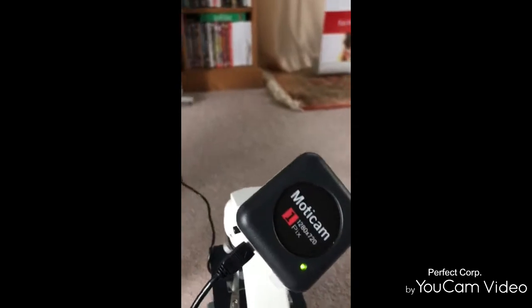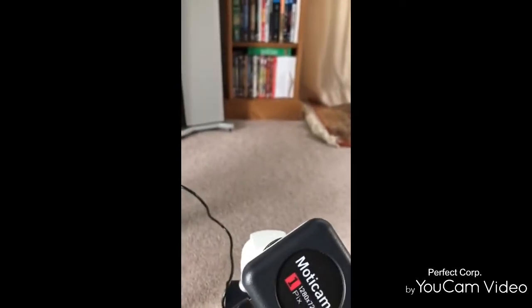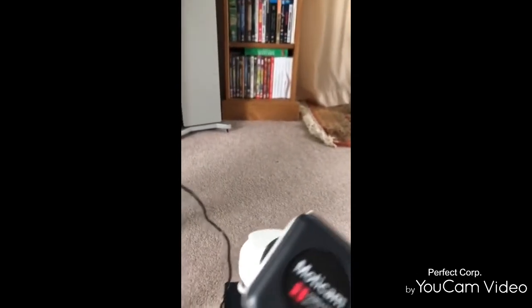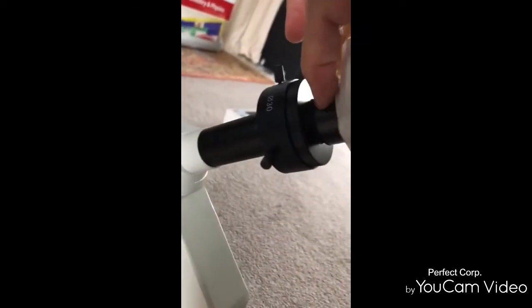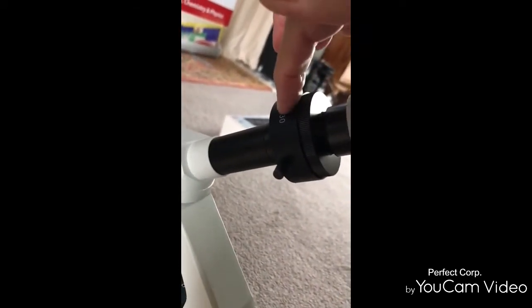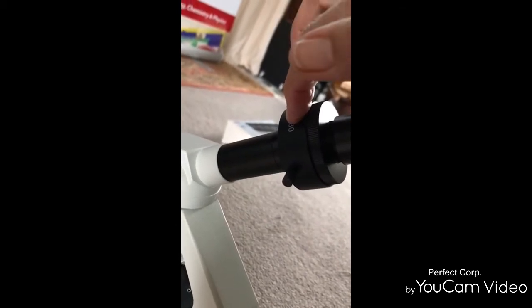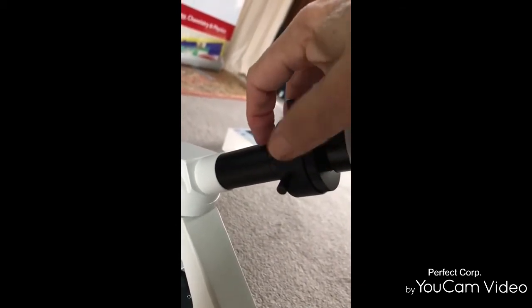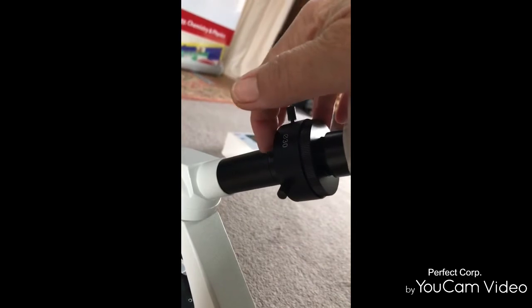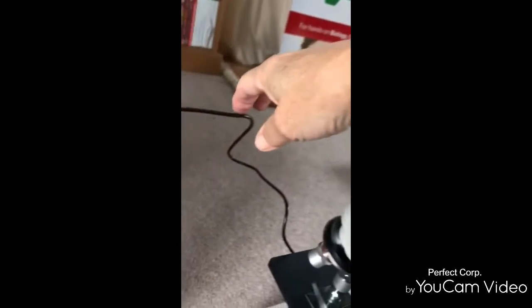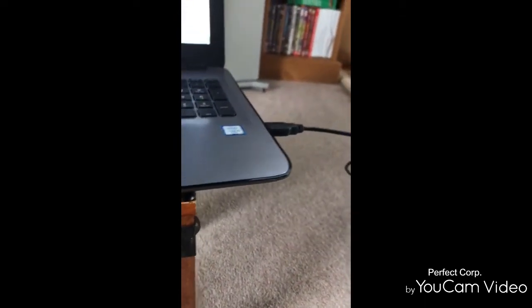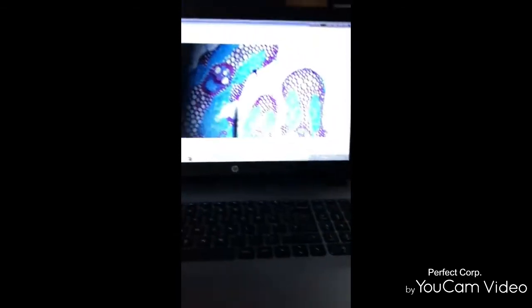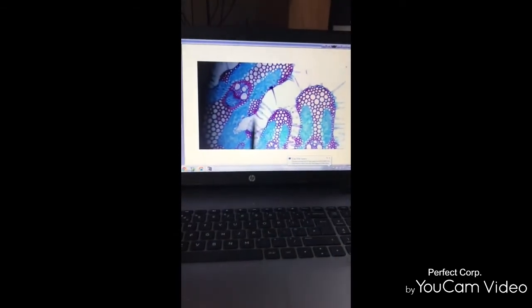So all you do is connect your Motorcam to the lens and to the eyepiece adapter and screw it directly onto the eyepiece tube. You don't take the eyepiece out, and then with a USB you connect it to your laptop or computer and there is the image.